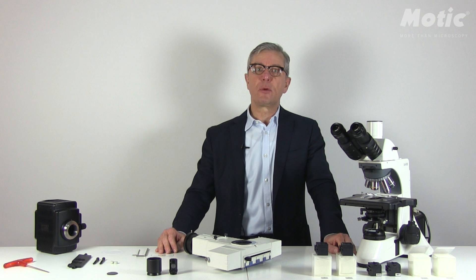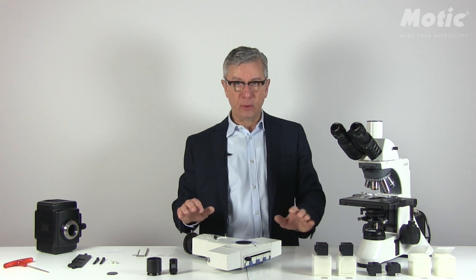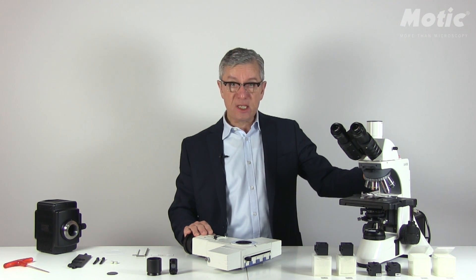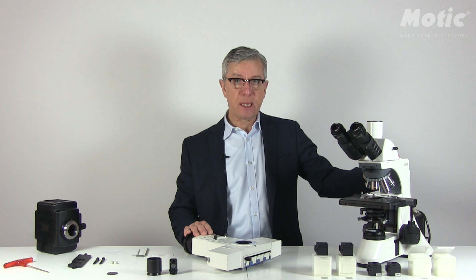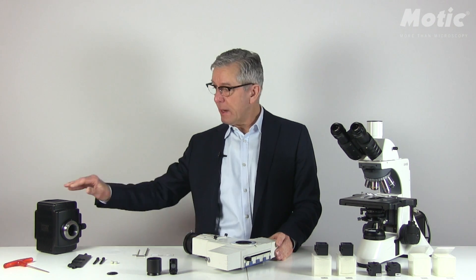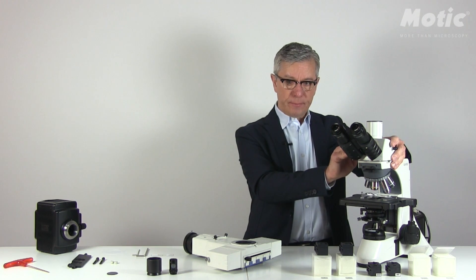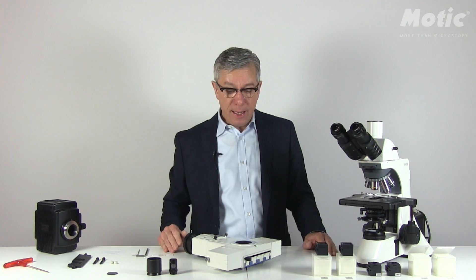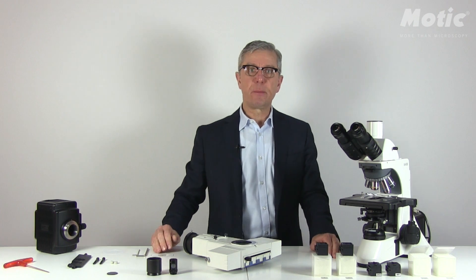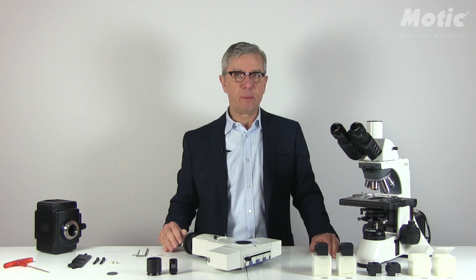Hello again, this is Hans-Johen Clemens speaking from company MOTIC. Today I'd like to talk to you about how to mount the fluorescence onto our BA410E microscope. I'd like to do this in three steps: step one, mount a T-shape attachment including the lamp house on the microscope stand; step two, mount the filter cubes onto the dovetail; and step three, do the final tuning and alignment of the illumination.